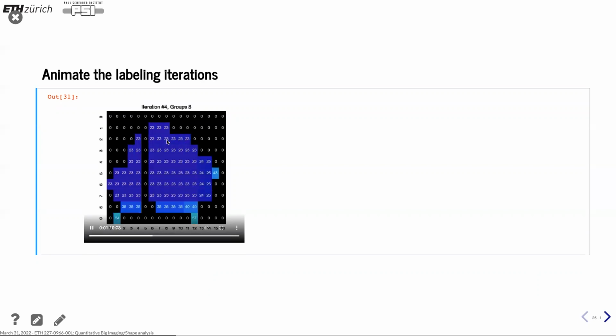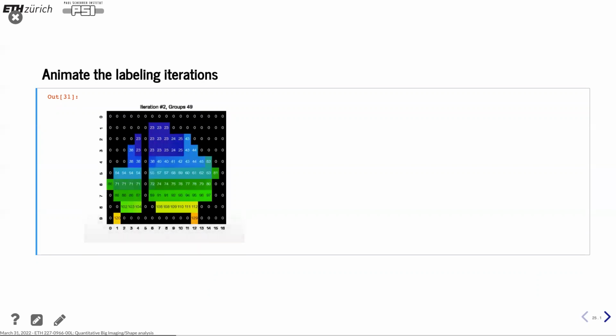That means we will label both objects into one. You do the labeling in fewer iterations, but you may do a bit too much reduction of the objects. Maybe that is what you want, depends on your application.